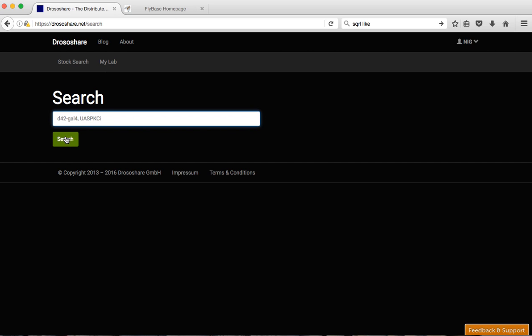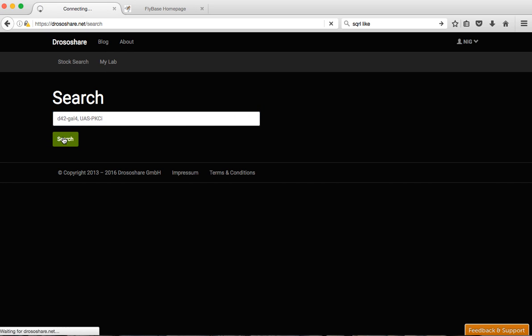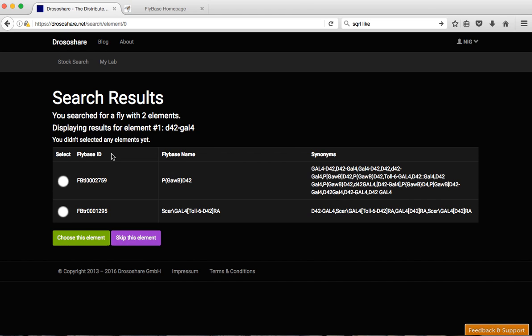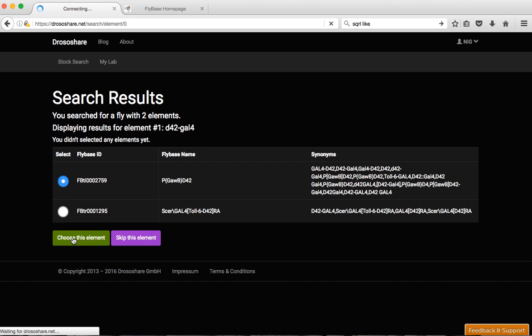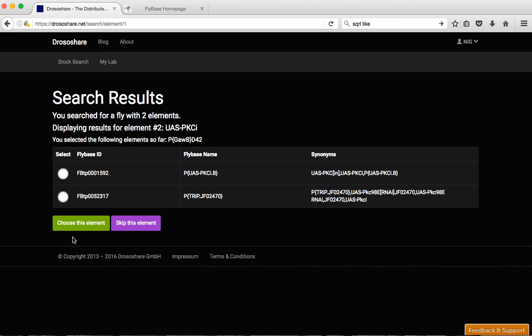That's the two elements we want in the experiment to block PKC in motor neurons. So the system will split the things in two. First we have D42-Gal4 and flybase that's this one and then USPKCI which is this element.